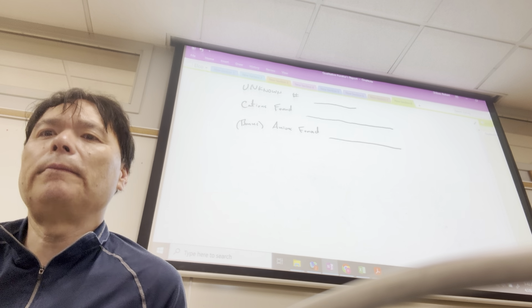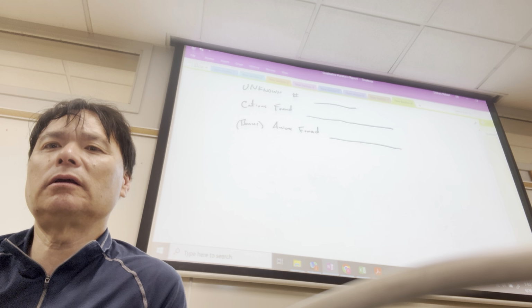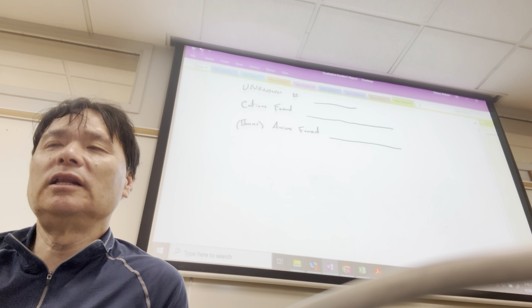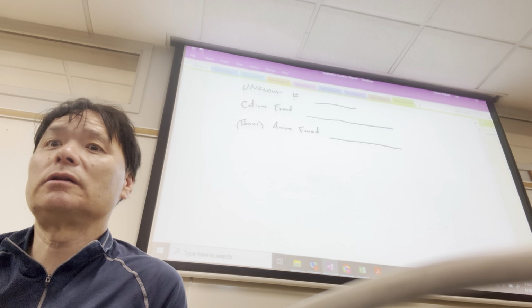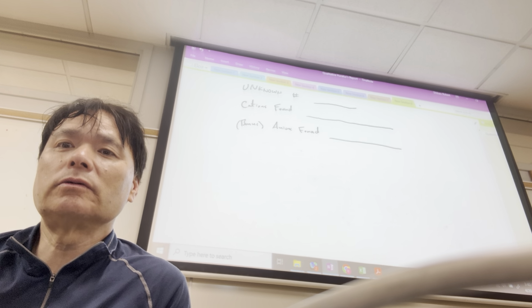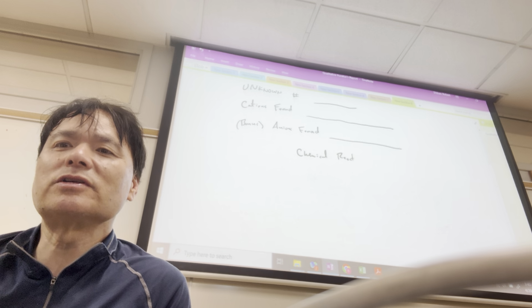All right. To make all the points not wrapped up in this, I want you to do one other thing. I want you to list the chemical reactions that were observed. And so chemical reactions, not the chemical reactions for your unknown, but chemical reactions for the qualitative analysis procedure.